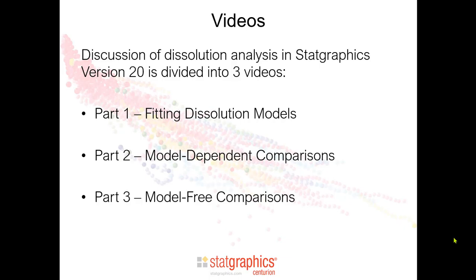This part 2 has to do with comparing the profiles of a test and a reference batch based on the models that were fit to those batches. Part 3 will cover making comparisons without fitting any models.